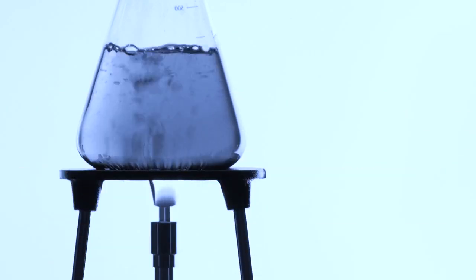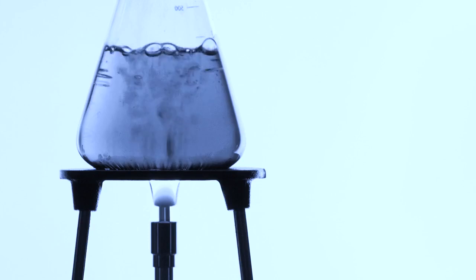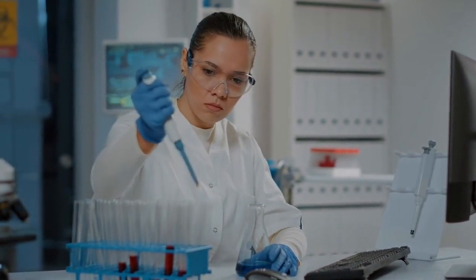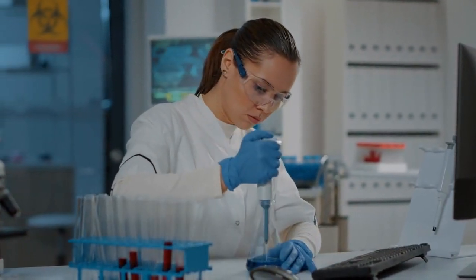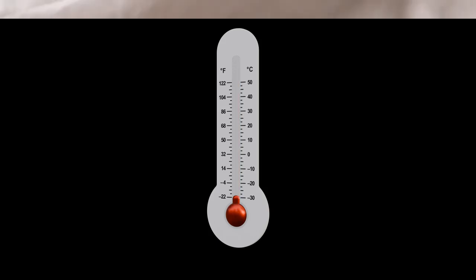Bunsen burner. A common heat source used in laboratories, which produces a single, open flame for heating or sterilizing objects. Thermometer. A device used to measure temperature, typically containing a glass tube with a liquid, such as mercury, that expands or contracts with temperature changes.